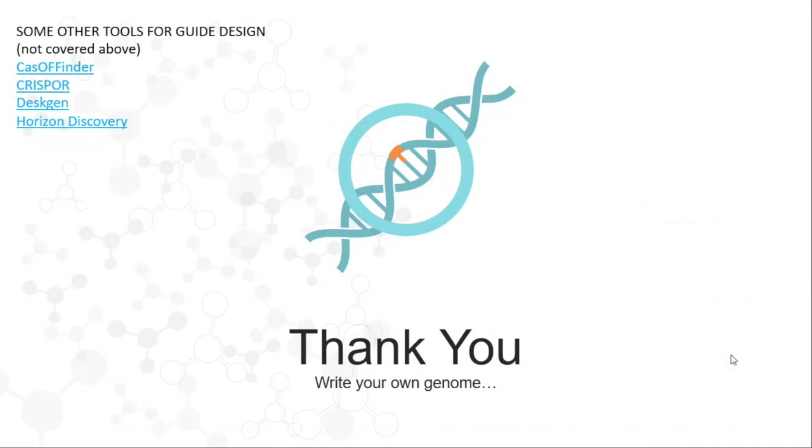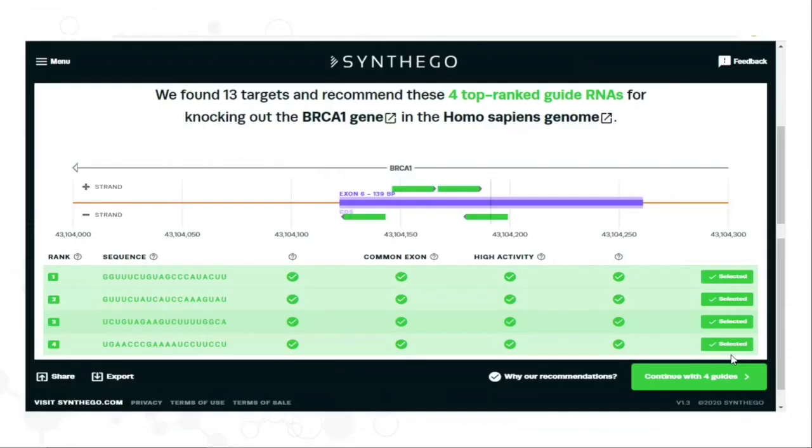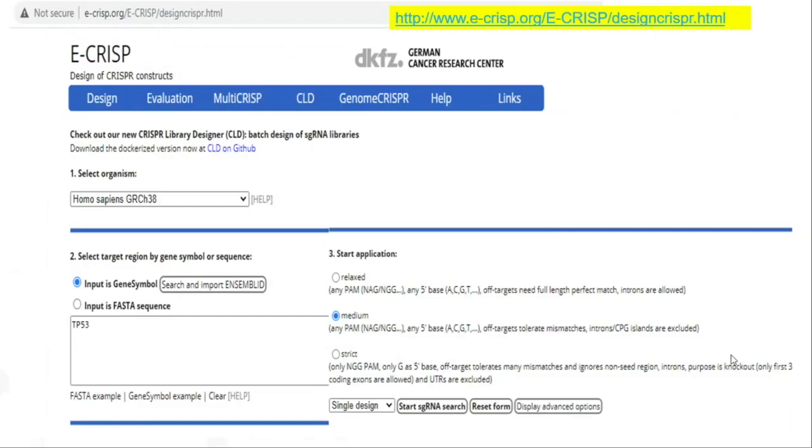Okay, so should I give all the options, Dr. Tani? Which option should I give them? I think you leave it blank and let them write the answer, or you want to do a poll. So maybe you could do IDT, then Sanjana Lab, Chop Chop, then GPP.